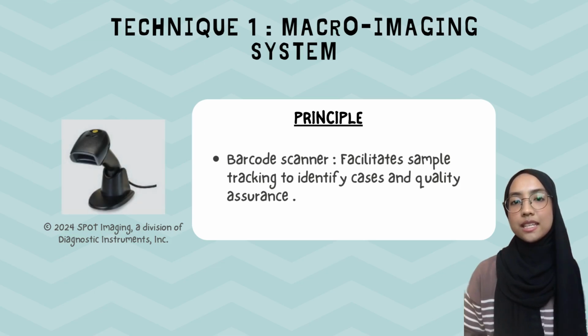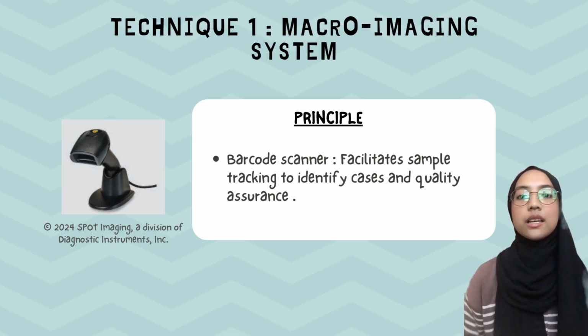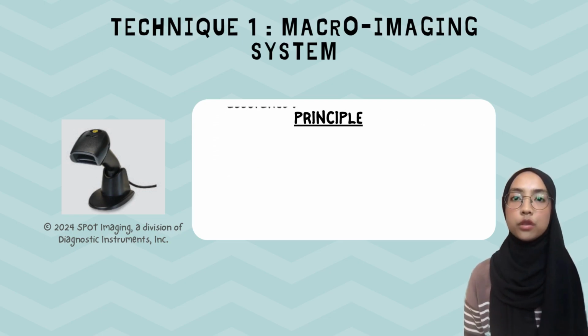Furthermore, there are barcode scanners, which help to identify and track cases and also to guarantee quality assurance. Barcode scanners accurately track and link specimens to their corresponding data to reduce the risk of errors, ensuring that each sample is properly identified throughout the workflow.